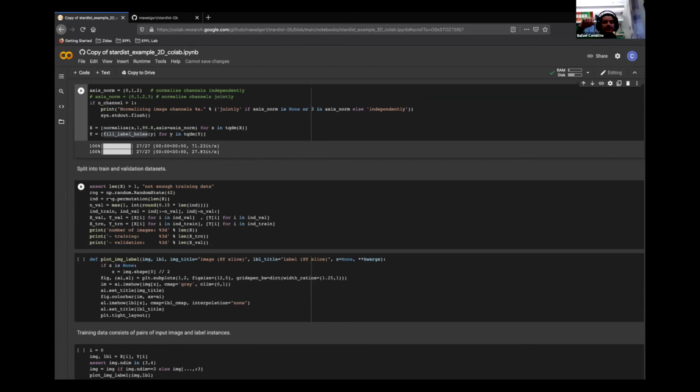Right. Okay. Yes. So there should always be an object somehow. There should always be an object, yeah. I mean, if you want to run the notebook as is, that's the case. You should always have something that doesn't break the normalization. Of course, this is Python code, right? You can do whatever you want here. You can just divide by 1,000, right? And then it would be fine for background stacks, right?